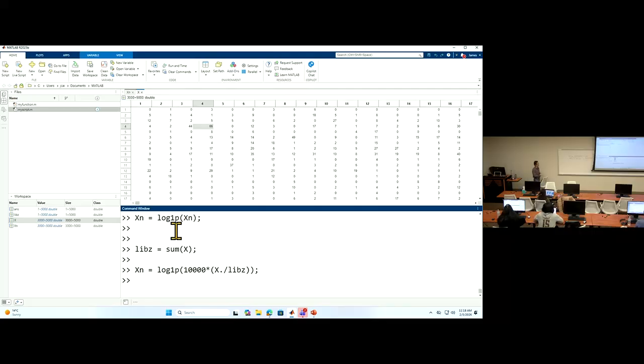So from the QC'd X matrix, we use 2 lines of code to finish the most commonly used normalization and transformation. There are other ways to do this procedure, but this is sufficient most of the time.